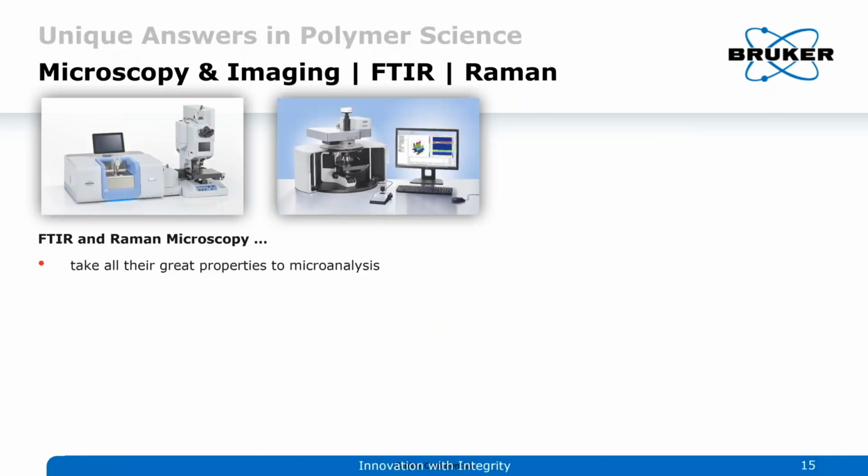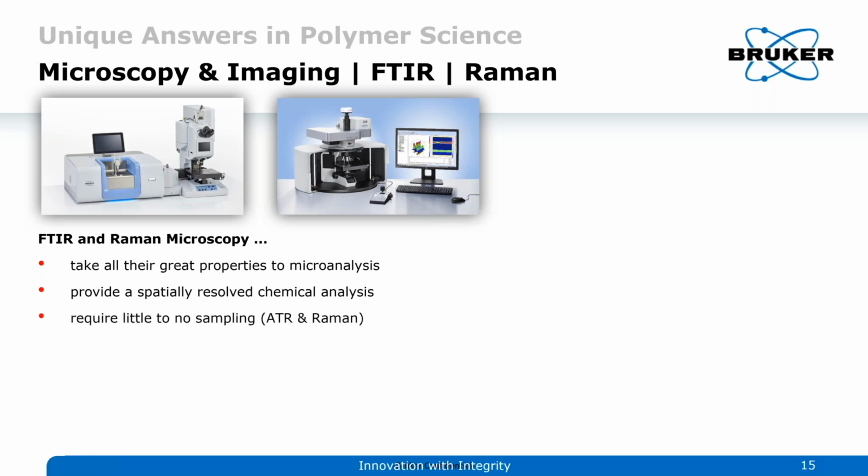So let's take another small detour and look at Raman and IR microscopy. We talked about doing static measurements. Now we're going to place the sample on a unit where the sample stage can be moved around. In the FTIR's case, it may be attached to an infrared spectrometer to do macro measurements, as you can see the ATR accessory in the sample compartment, or on the stage.